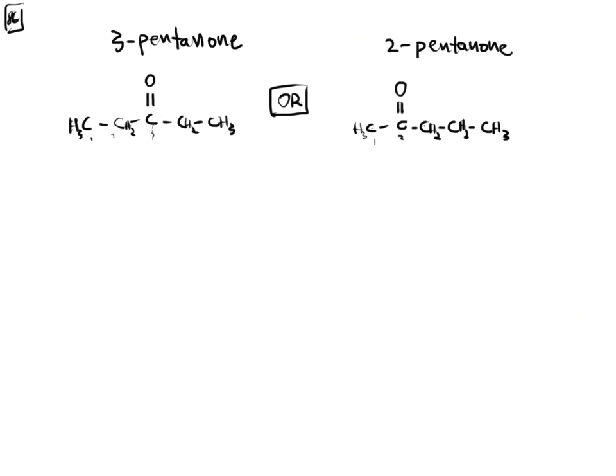All right, so I told you that this is typically what we would normally call an alpha carbon with the alpha carbon cleavage, and I'm going to chop it off on one side. When I do that, these electrons can move in to the C double bond O and create a positive charge. So I need to add up that type of fragment: C triple bond O, that carries my positive charge, and then my CH2, and then my CH3.